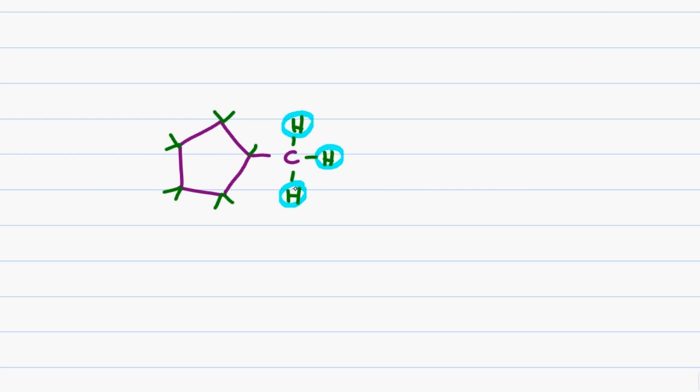Let's look at one more example, a methyl cyclopentane, where the hydrogens will be represented by green lines, and I'll draw out the hydrogens on the substituent. The methyl substituent is different from any other carbon on the ring, and so the 3 hydrogens on the methyl are considered equivalent. The tertiary carbon on the ring has a unique hydrogen, making it 1 type. Next to that, I have 2 hydrogens on a secondary carbon. However, since this is symmetrical, the 2 lower hydrogens on the secondary carbon are also equivalent.